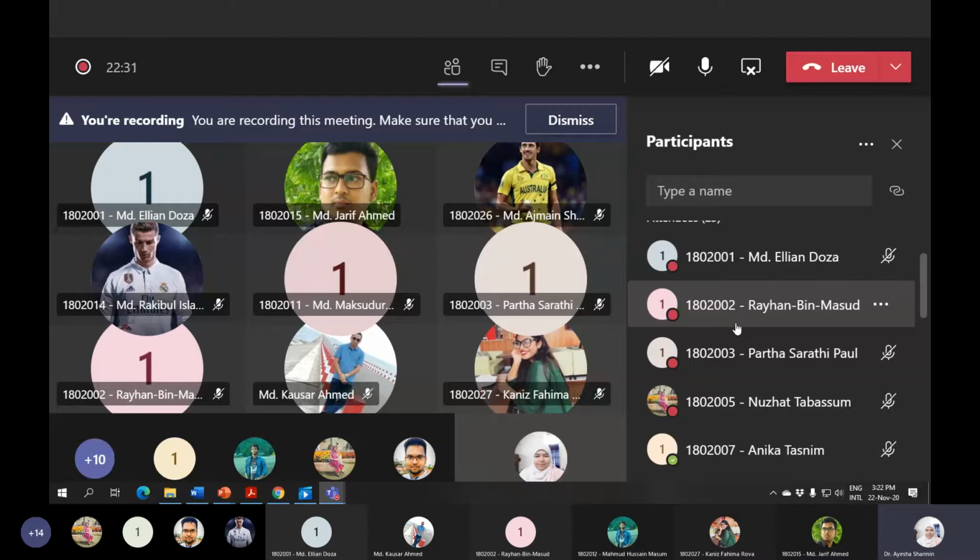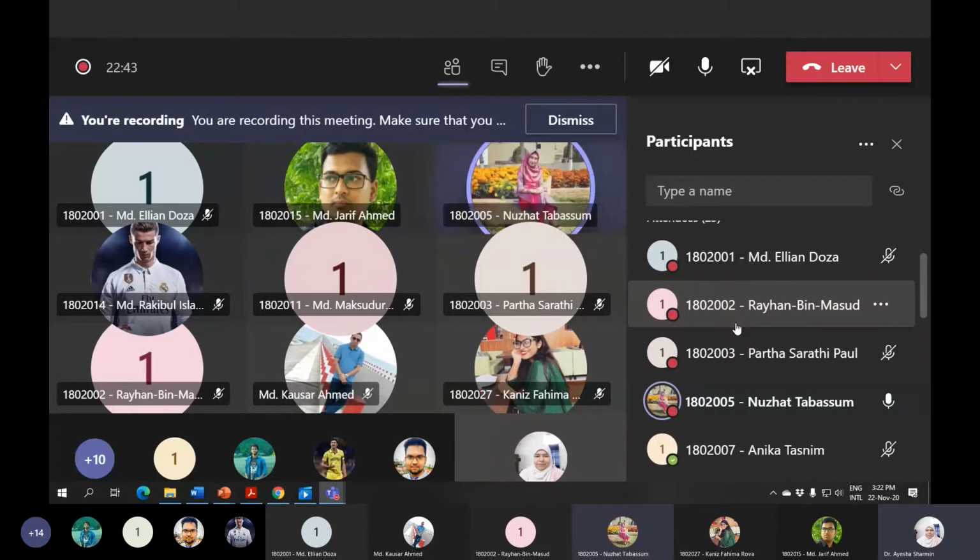আচ্ছা, রোল নাম্বার 5 নুজহাত তাবাসসুম। ইয়েস ম্যাম। তোমার মনে আছে কোনটা সম্পর্কে এরকম? ম্যাম আয়োডোমেট্রি মনে আছে, বাট এক্সাক্ট এক্সপেরিমেন্টটা মনে নেই। আচ্ছা, এক্সপেরিমেন্টটা মনে না থাকুক, কিছু প্রিকশন ছিল মনে আছে সেখানে আয়োডোমেট্রিতে?